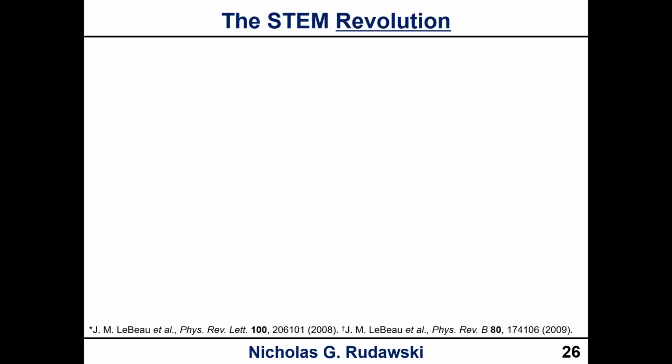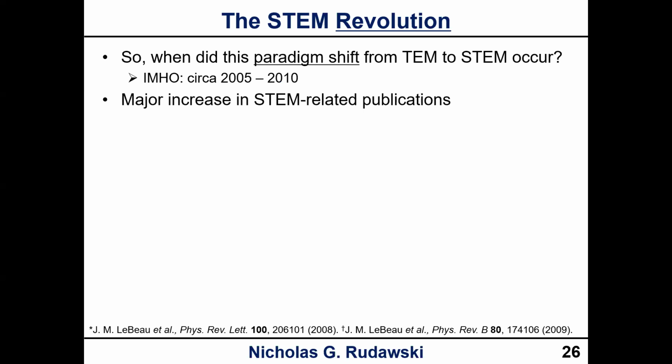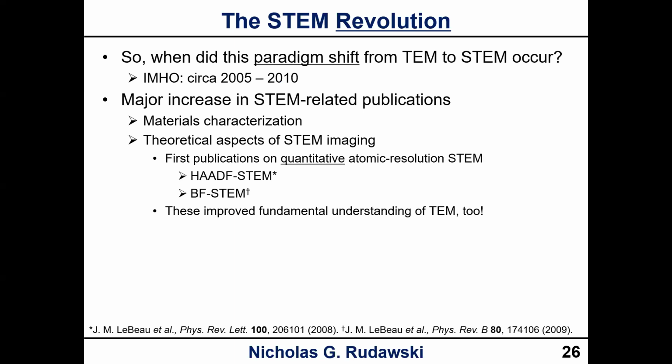So what am I talking about when I say the STEM revolution? I call this a paradigm shift, from TEM to STEM, when STEM started becoming more important than TEM. This is entirely my opinion, but I'm going to say between 2005 and 2010 was when this paradigm shift occurred. The reason is that we saw a major increase in STEM-related publications, in materials characterization using STEM, but also in theoretical aspects of STEM imaging.